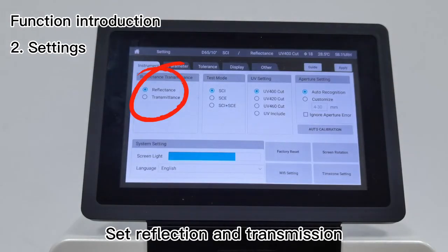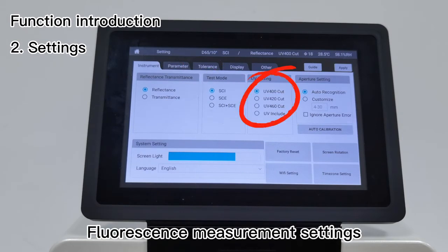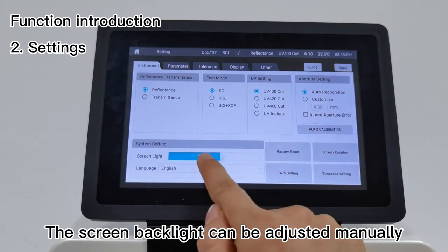Set reflection and transmission, set SCI and SCE mode, fluorescence measurement settings, and caliber setting. The screen backlight can be adjusted manually.